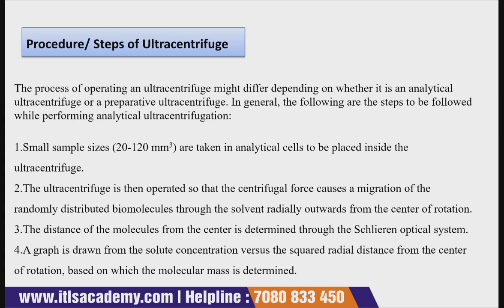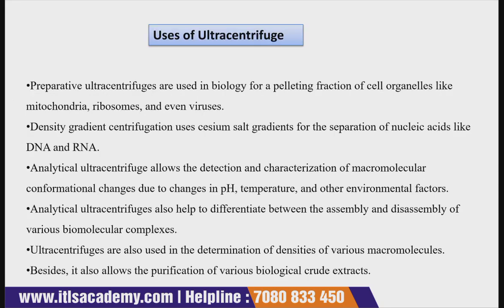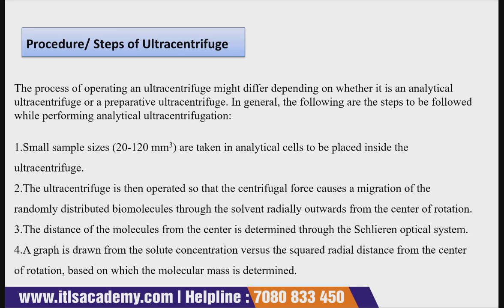You should always keep in mind that ultracentrifugation is operated on the basis of the sedimentation principle, and the force that is required here is the centrifugal force, and small size samples are taken, which we have already discussed when we discussed the differences between analytical and preparative. These are certain steps that are involved whenever you are doing experiments in the centrifuge and ultracentrifuge.